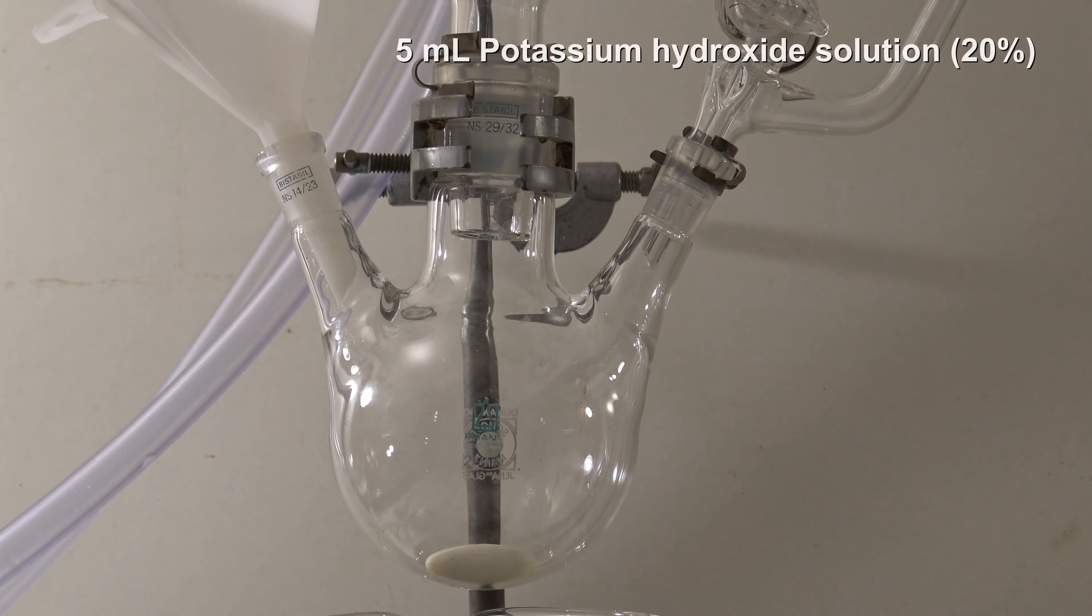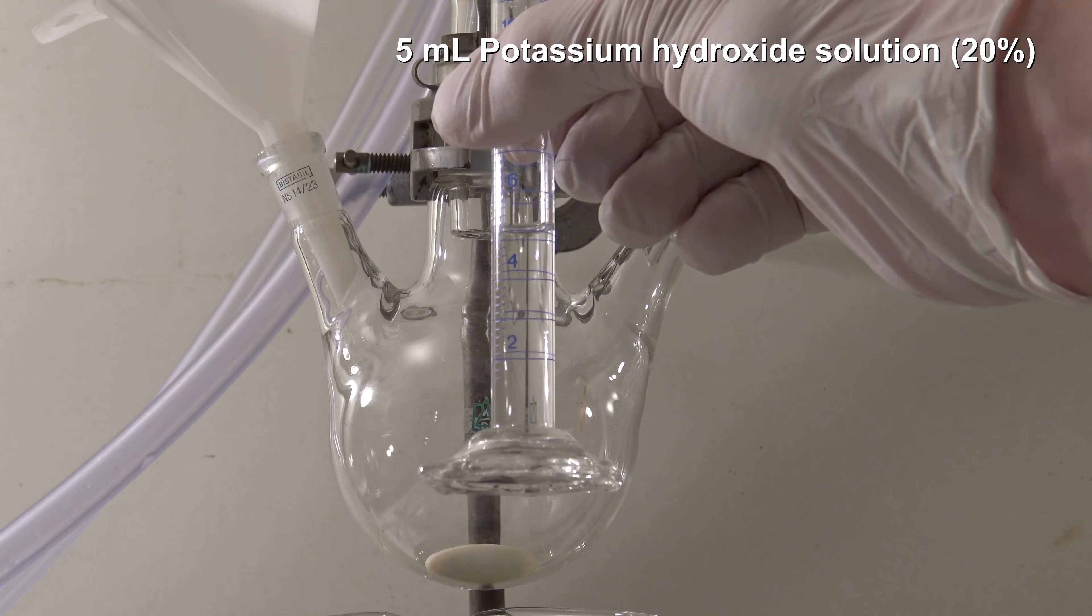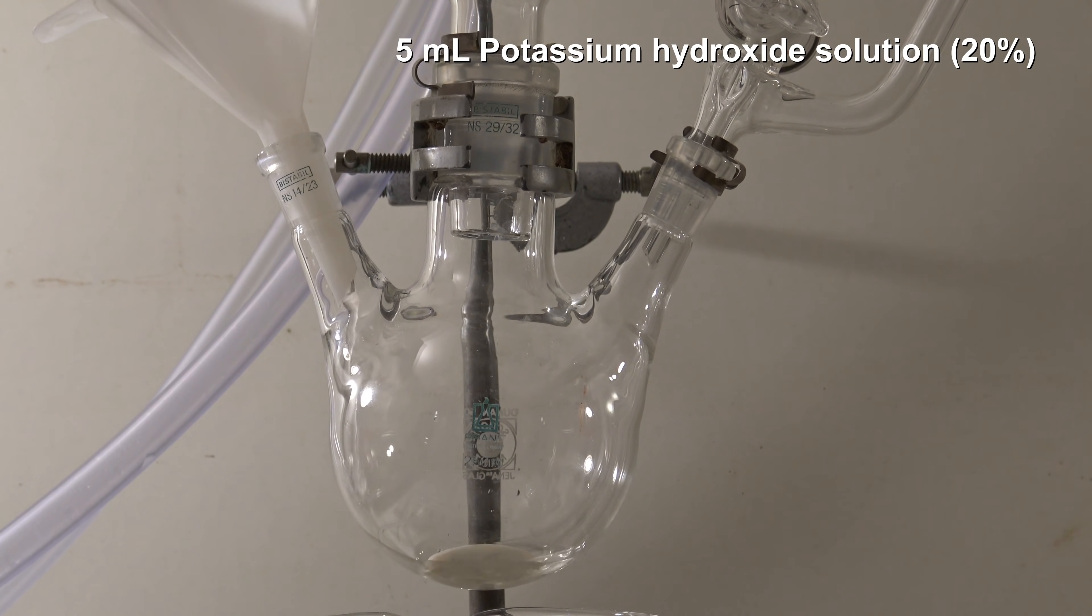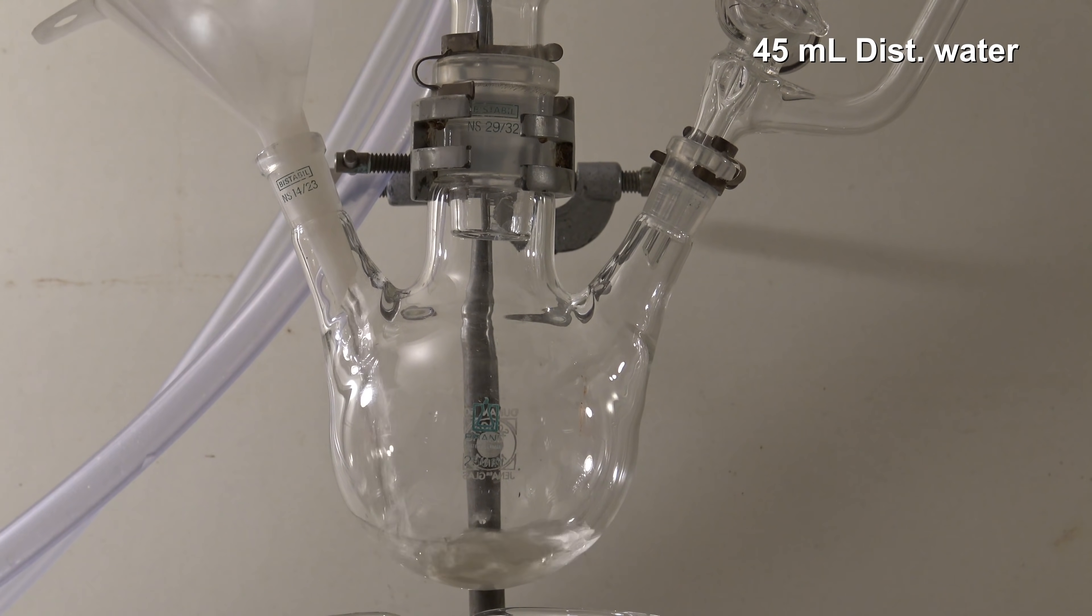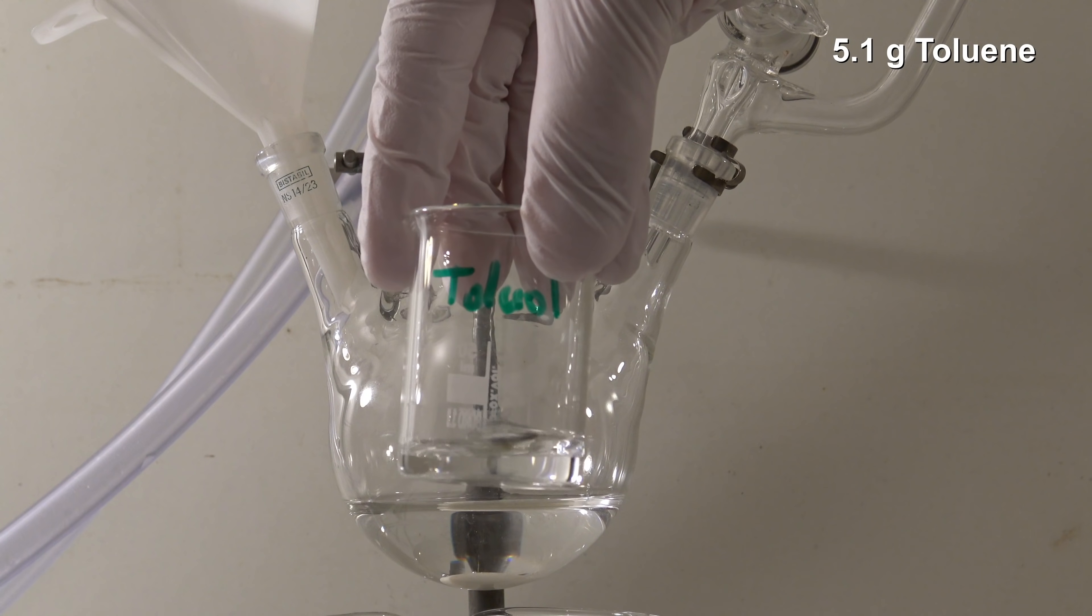At first, five milliliters of 20% potassium hydroxide solution were added to the flask. Then, 45 milliliters of distilled water were added, and 5.1 grams of toluene.